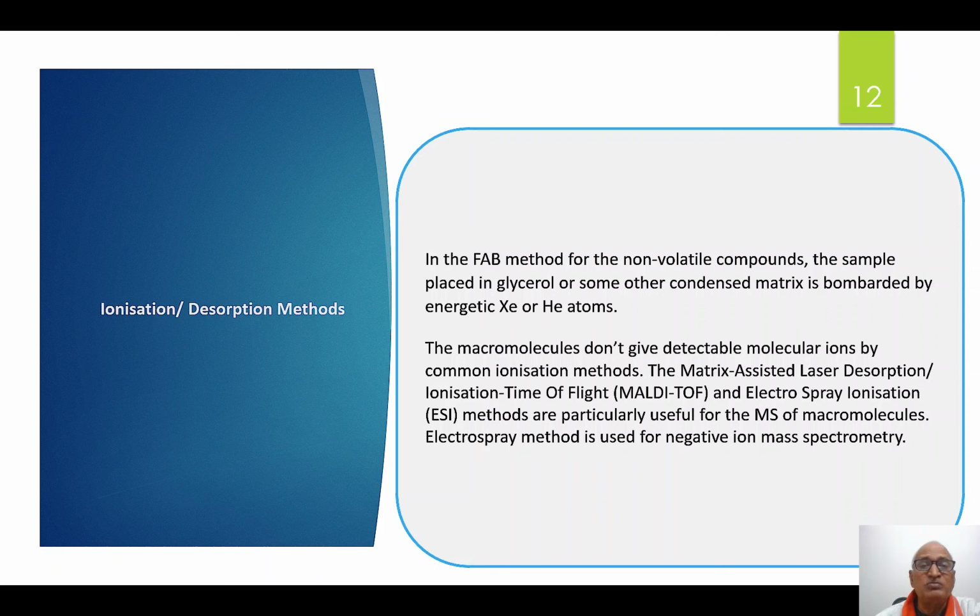In the fast atom bombardment, that is FAB method, it is applicable to non-volatile compounds. The sample is placed in glycerol or some other condensed matrix and it is bombarded by energetic xenon atoms or helium atoms. The macromolecules do not give detectable molecular ions by common ionization methods. The method used for them is matrix assisted laser desorption ionization, time of flight. Short form is MALDI TOF.